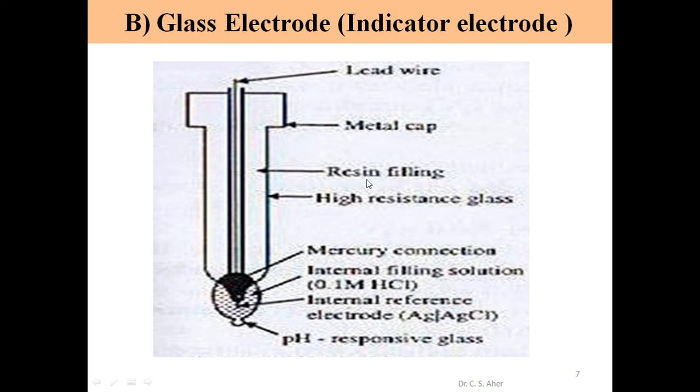Inside this, what we have is the resin filling. This is the resin filling support. Outside this, what we have is the metal cap. This metal cap is there, and in this metal cap we have a tube which is inserted by the lead wire.